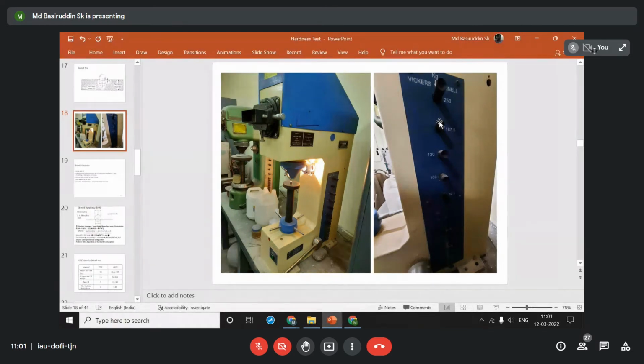Generally, when we manipulate the indenter diameter and the load, we initially think of two categories. For hard material, the maximum load is 3000 kgf as per standard, and for soft material, it is 500 kgf. Those are the two extreme points. But it is not that for soft material 500 kgf is fixed; maybe we can reduce that load. Whenever we set the indenter, we just follow these two rules, that is 3000 kgf or 500 kgf.